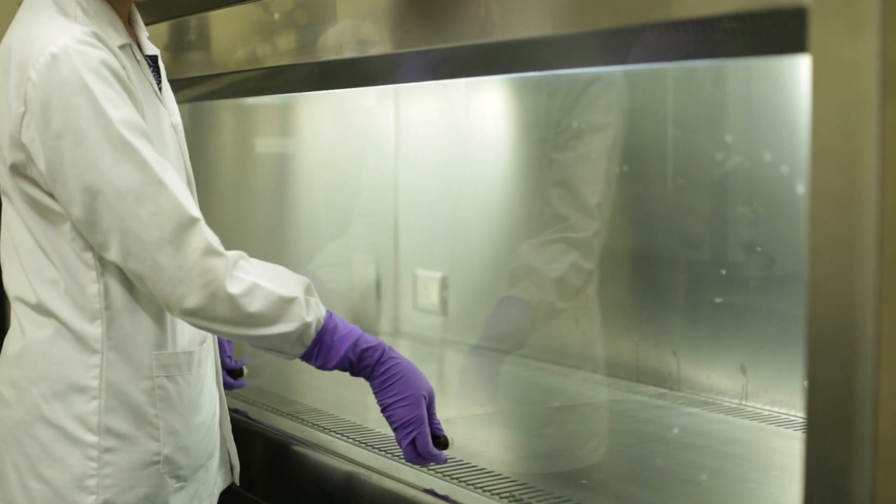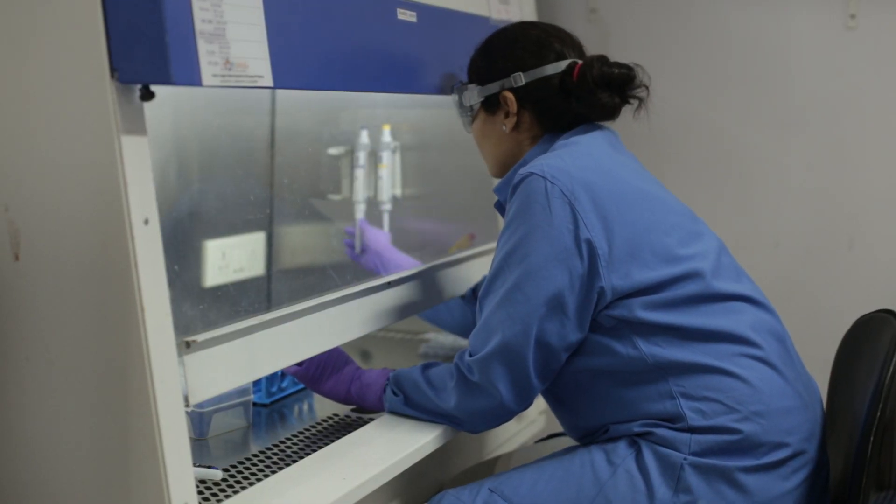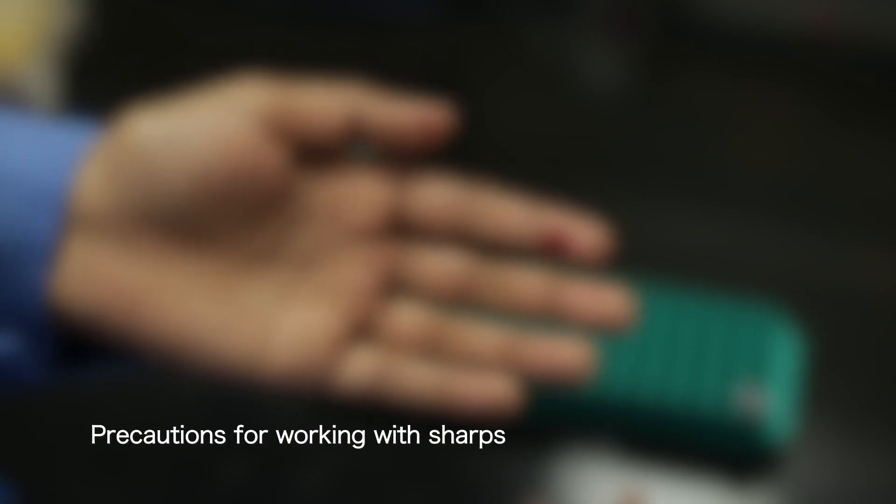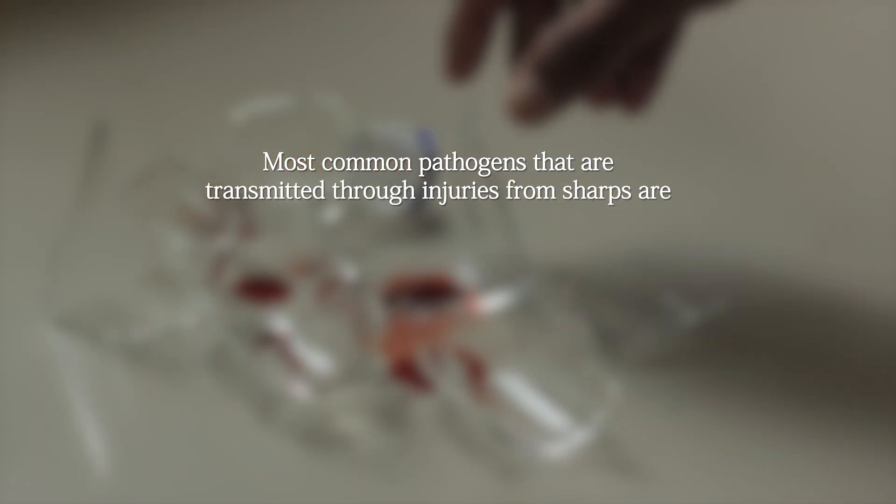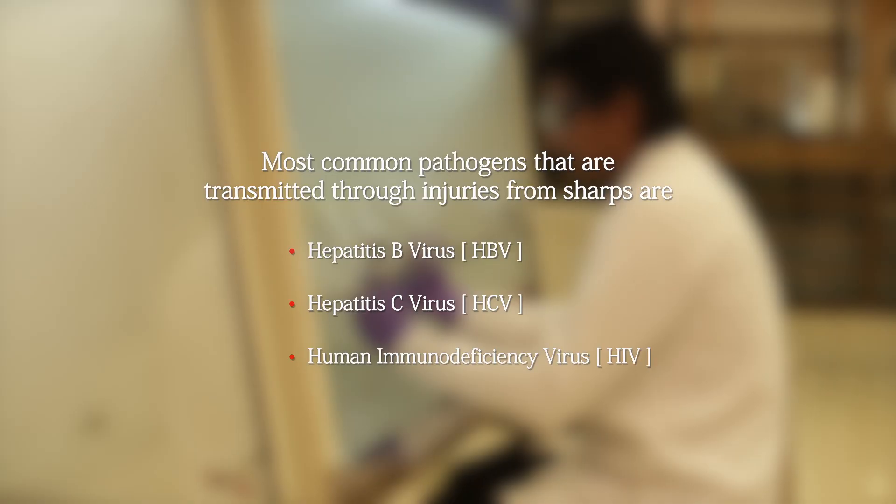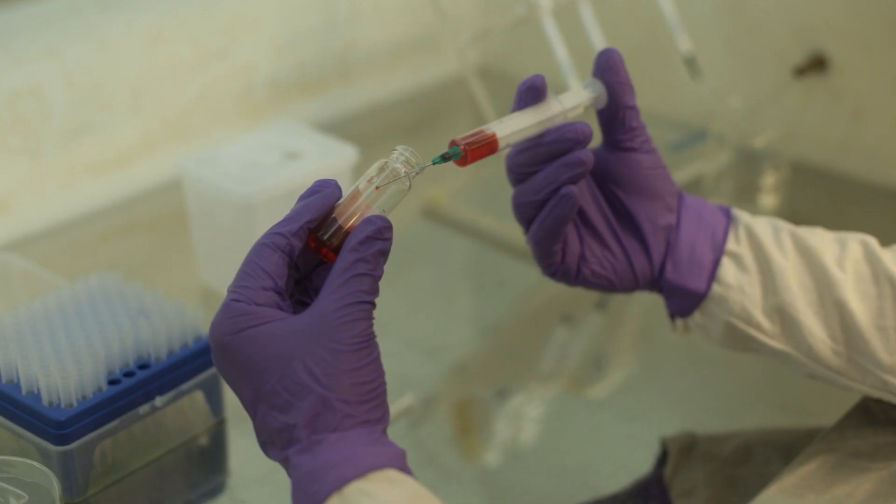To prevent splashes to the mucous membranes, conduct activities inside a biosafety cabinet and wear eye protection. Injuries from contaminated sharps can transmit blood-borne pathogens and other infectious agents. The most common pathogens that are transmitted through injuries from sharps are hepatitis B virus, hepatitis C virus, and human immunodeficiency virus.